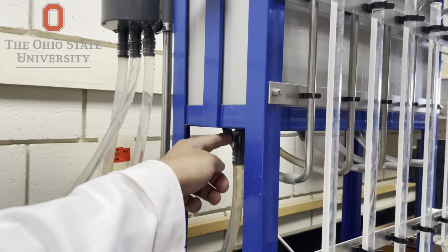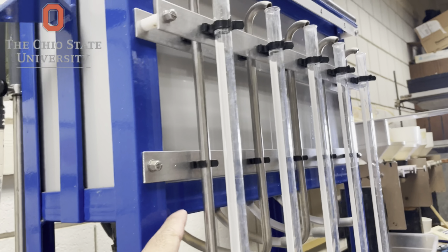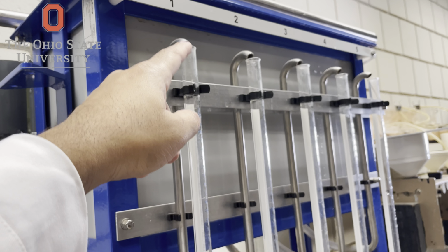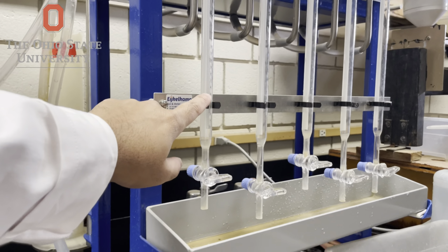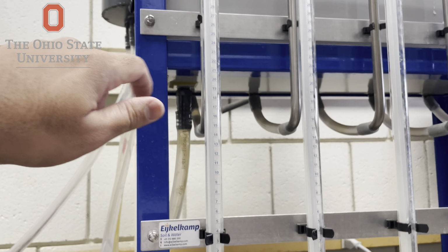Now percolated water is collected in a graduated cylinder. Here you can see, volume is measured over a known time interval. This gives us the discharge rate, which is required for saturated hydraulic conductivity calculation.